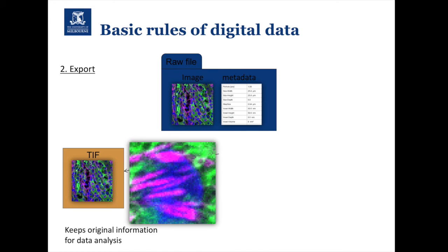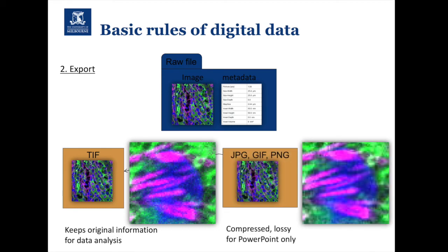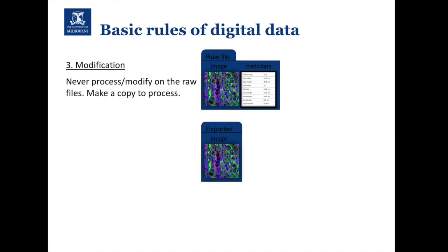Second, if you're going to export your data, please export it in the TIFF file format, because this keeps the original information for any downstream quantitative analysis. The issue with using JPEG, GIF, or PNG is that they often use lossy compression, which means you lose information. You can still see in the two example images that the right-hand one is more averaged out, with a little less information. You can still use these formats for PowerPoint or printing for your lab book, but for any quantitative analysis, save as TIFF.